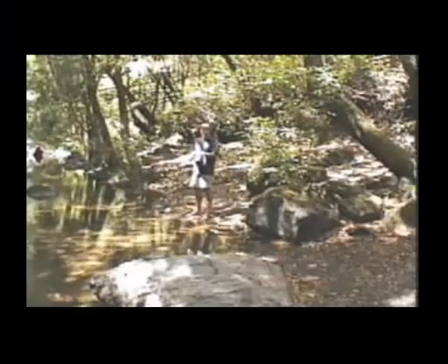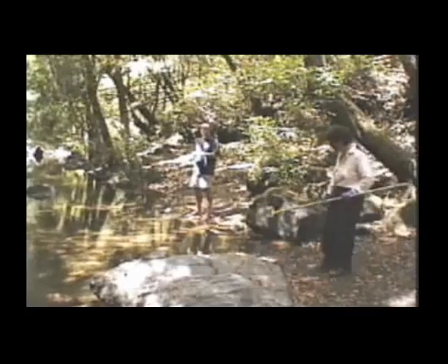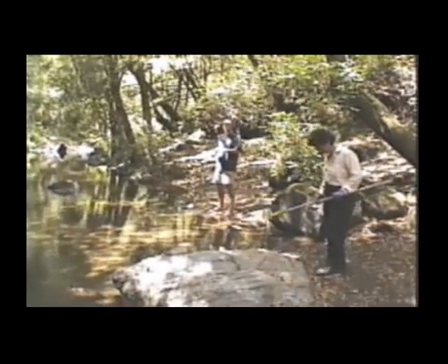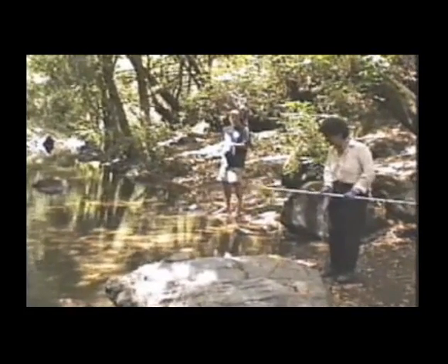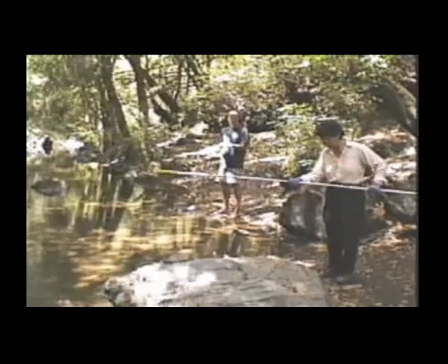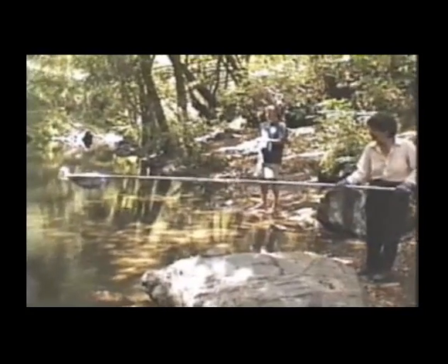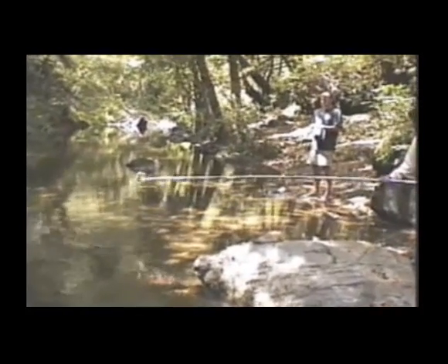Okay, now we will be demonstrating the use of a pole sampler. In this particular case, the sampler is unable to wade into the water, and the water close to the bank is an unacceptable location for collecting a sample. We want to try to collect a sample in the centroid of flow, which is some distance from the bank. So the sampler will be using an extendable sampling pole with a container on the end, and in this case she can then access the centroid of flow.